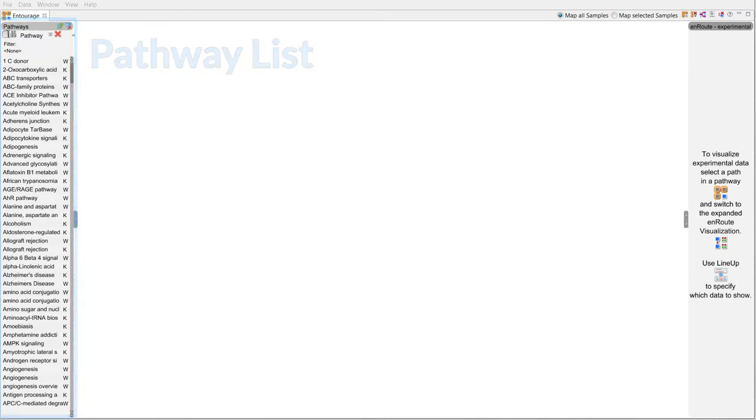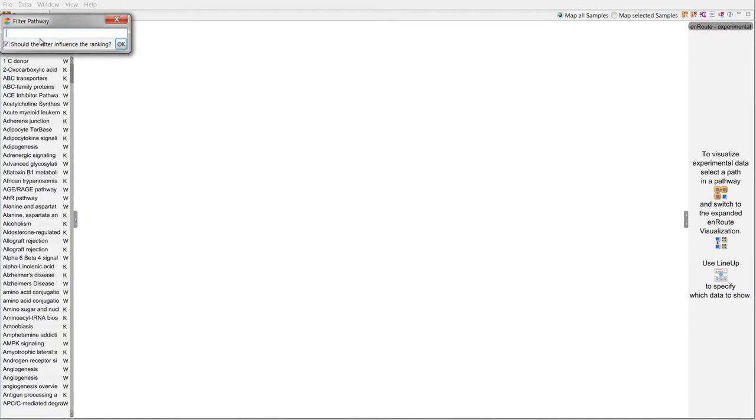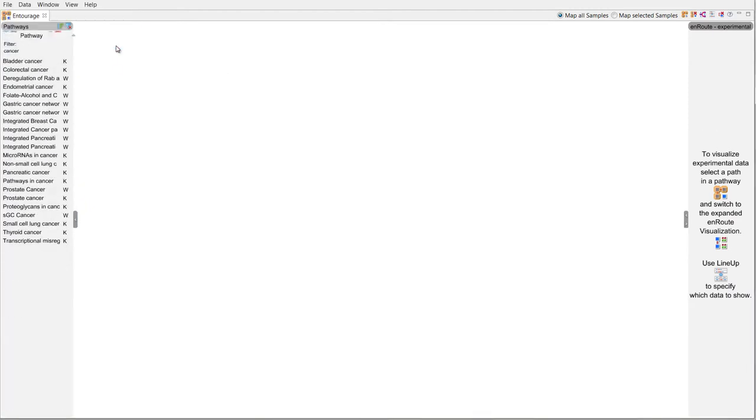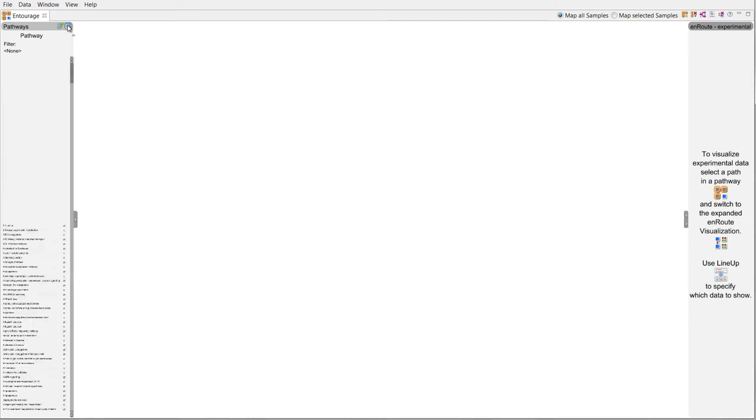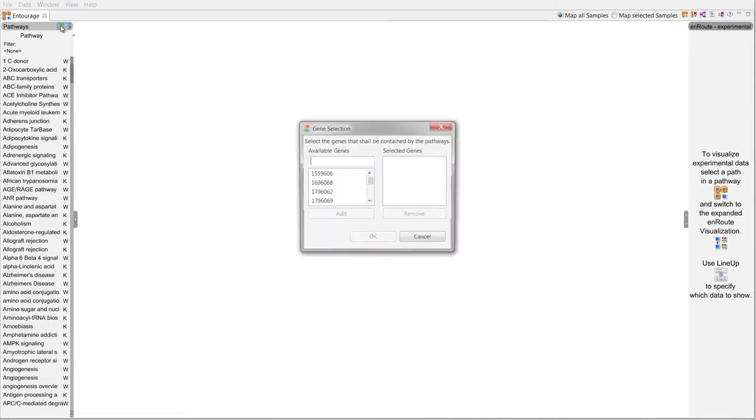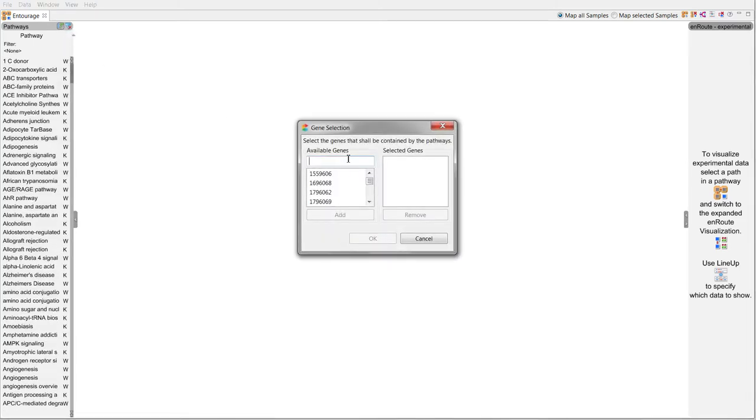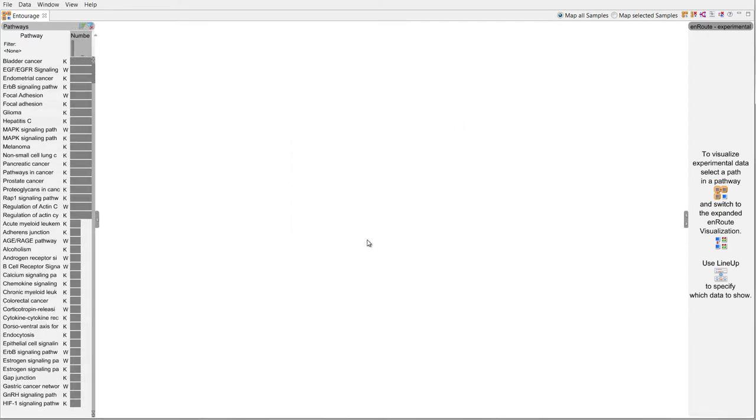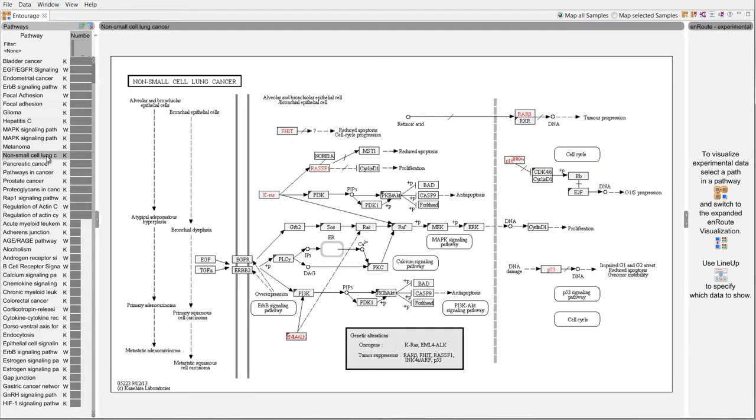We can filter the list to find pathways by name or find pathways that contain specific genes. We choose the lung cancer pathway and add it to the main window.